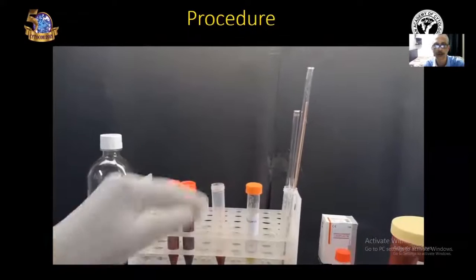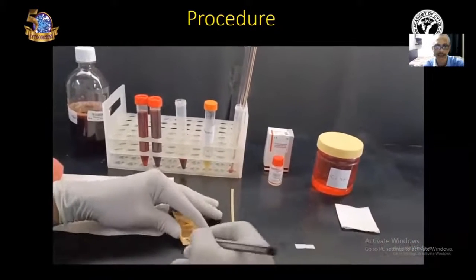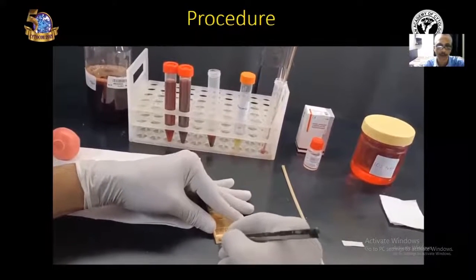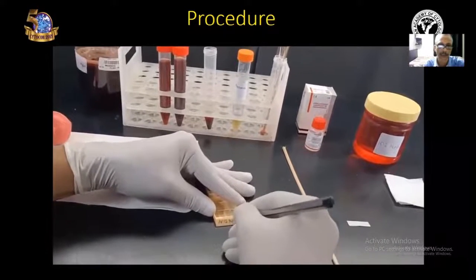Now, we have to transfer this clot into the cassette. For that, first take the tissue cassette and label the cassette with the specimen number. We can use a lead pencil for this purpose. You can see the cassette is being labeled.